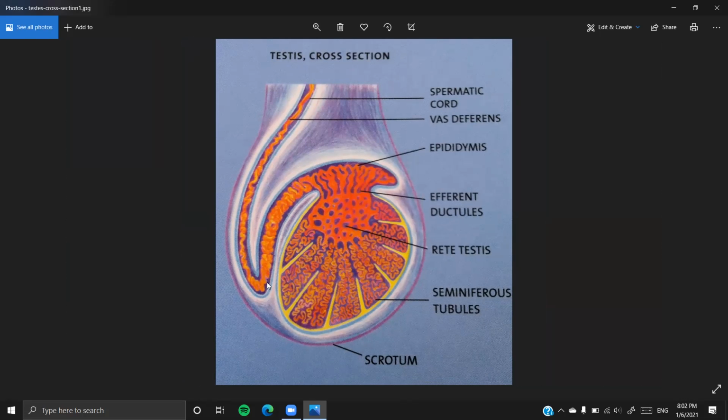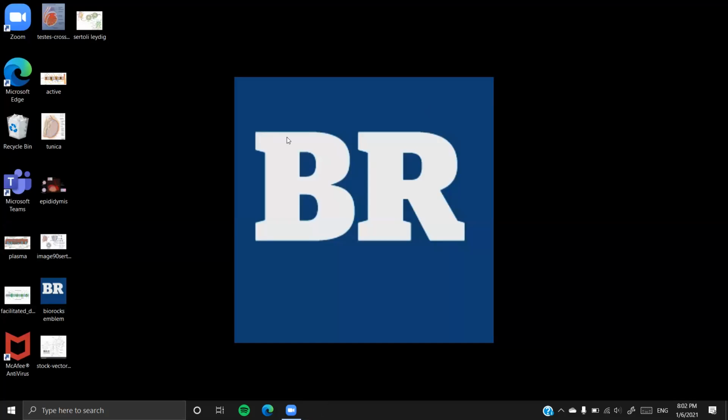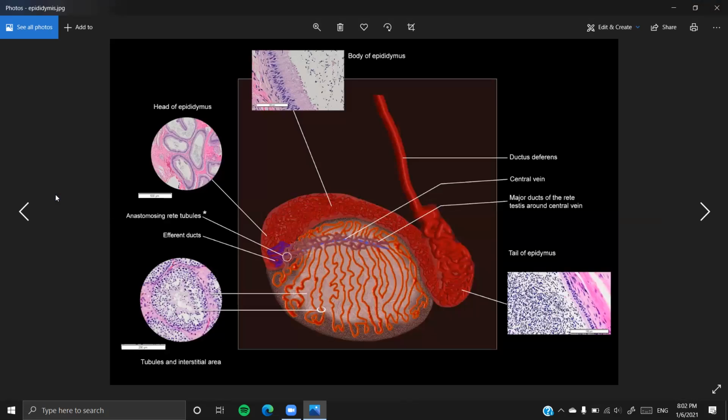epididymis. And later you can see the long muscular tube which develops, which is called the vas deferens or sperm duct. You can see the vas deferens, and this is the spermatic cord that you can see. But this tube that is arising here is going to be the vas deferens. Okay, so these are the ones I needed to speak about, children. Let me show you the epididymis, which is also important from the examination point of view for you all.